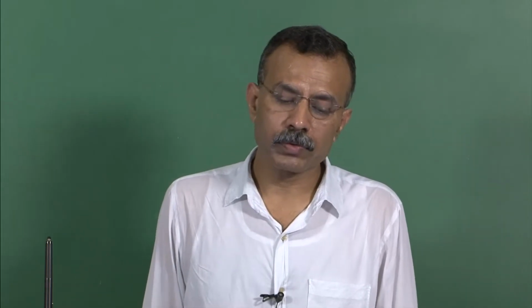We have talked about the characterization of the material in terms of characterizing the geometry, the size and morphology by using transmission electron microscopy, scanning electron microscopy and atomic force microscopy. I request you to go through what is scanning tunneling microscopy. Of course, I will provide the details in the notes, but I want you to look into it as an assignment.